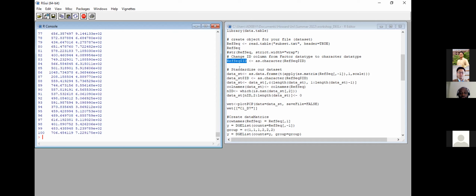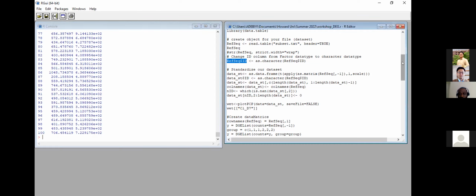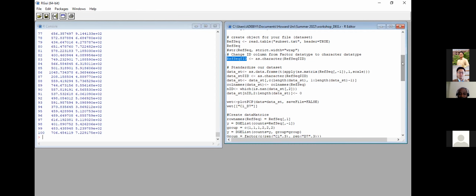In this case, what we're doing is setting the mean value for each observation to 0, and the standard deviation to 1. That makes all the numbers look like a normal graph. So you make them come to the center, very close together.